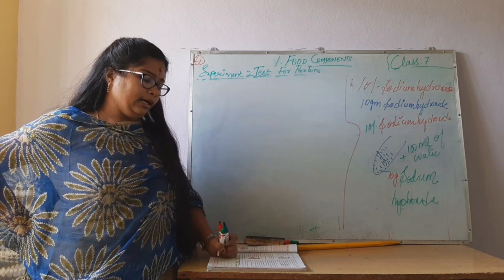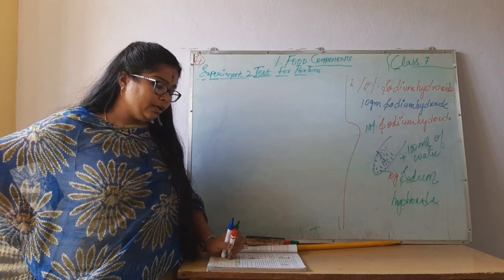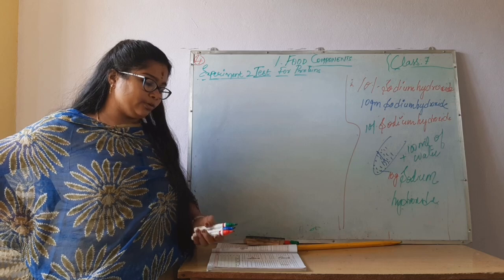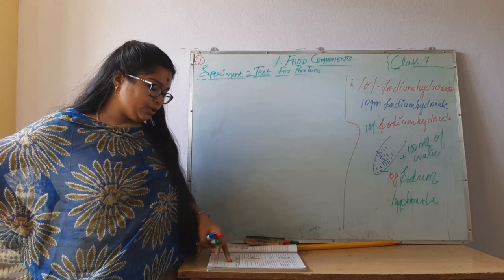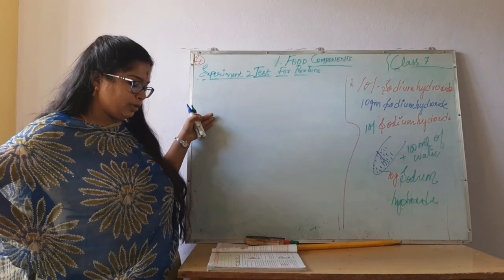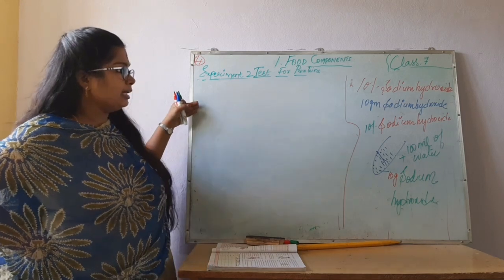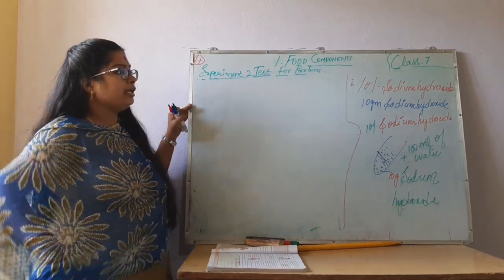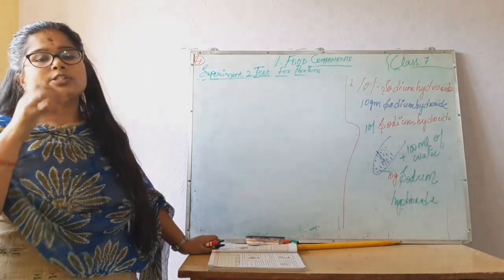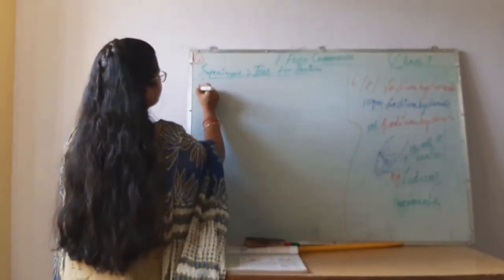Add a little of it in the test tube and add 10 drops of water to the powder and stir it well. Then add 10 drops of this solution in a clean test tube. So you have made, isn't it? So after making this, take 10% sodium hydroxide solution and 10 grams you have made. For this you need 2% copper sulfate and 10% sodium hydroxide.